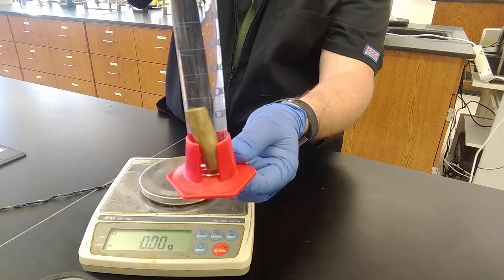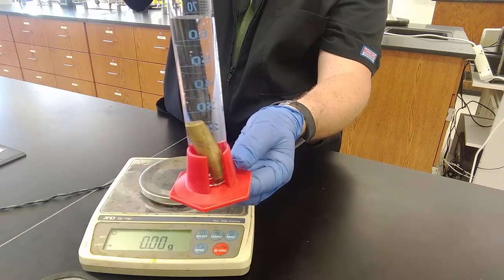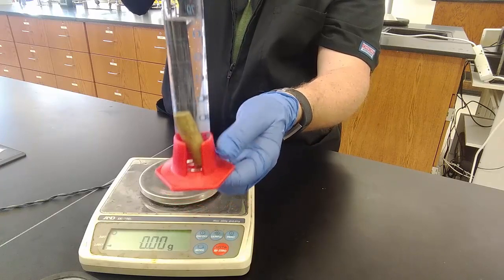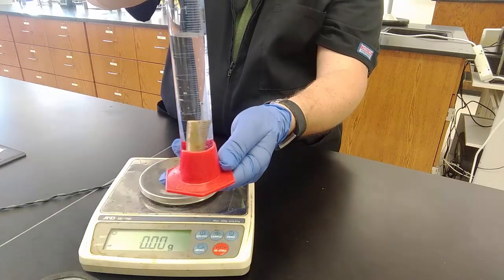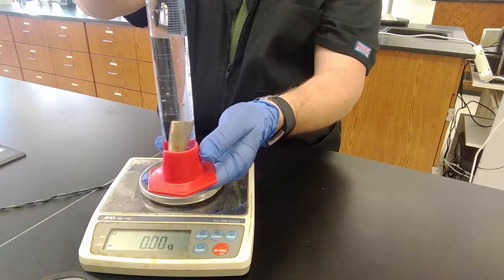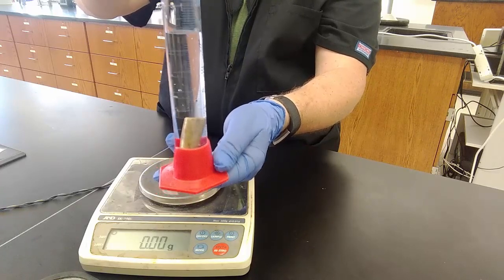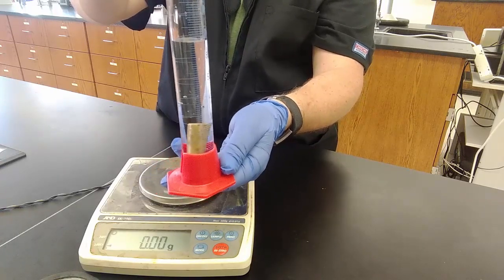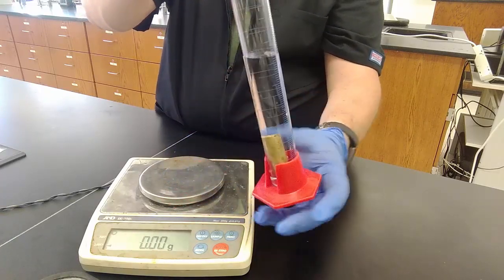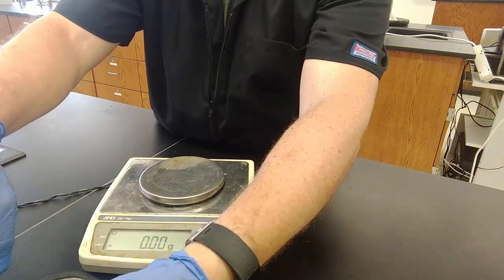It has submerged in the liquid, displaced the liquid in an equivalent amount to its volume. And so we know the volume of the bar. This is a great way of figuring out the volume of an irregular solid, is you submerge it in a liquid. Now if it floated, it'd be more of a challenge. There's ways of getting around it. You put a screen over it and push it down, but this works great for us. So we have the volume of our bar by measuring the difference. So since this is just water, I'm going to pour it into the sink.